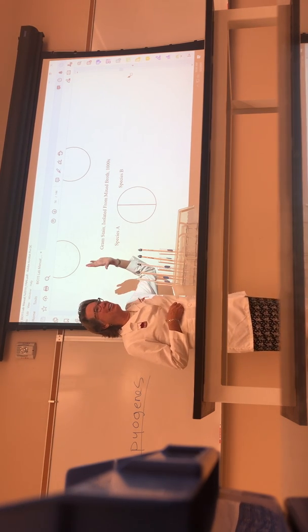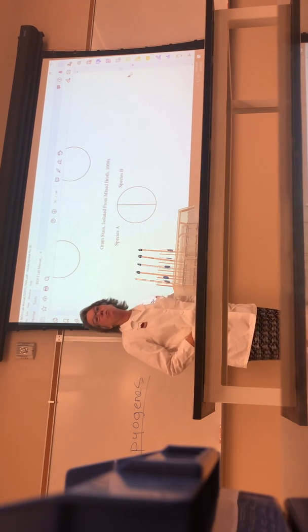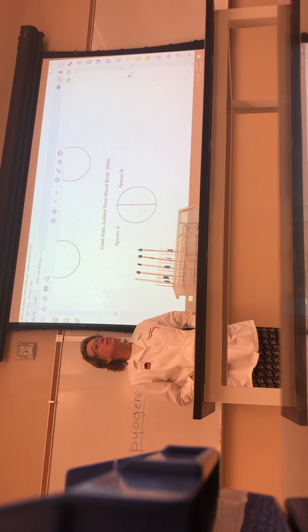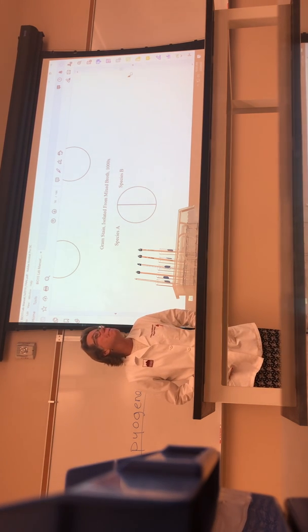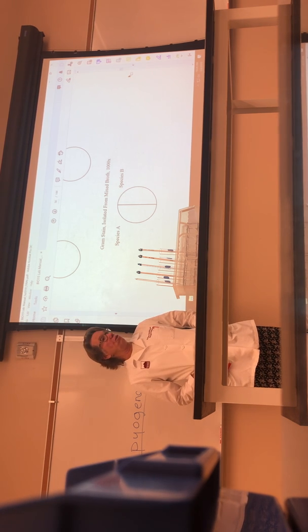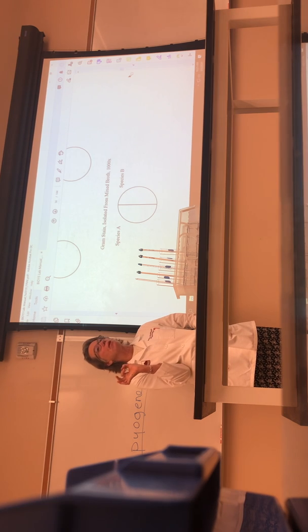Okay, some of you did. Okay, I know I gave a few. So if you had it growing on salt, you were supposed to do the same thing. Because guess what? If it grew on salt, what was it? Gram positive.